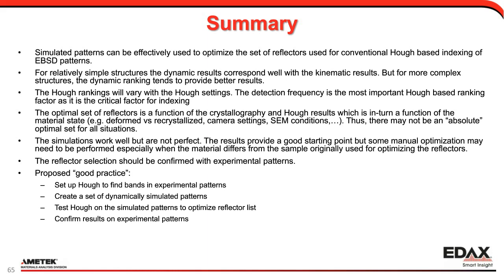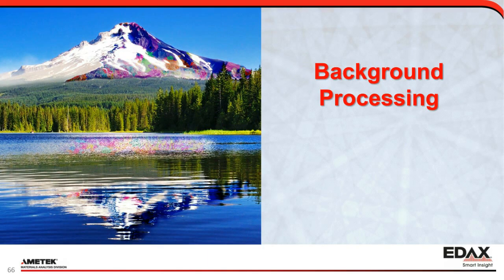And this will give us probably our best results that we can get to get started with indexing a new material. So that wraps up what I wanted to say about the optimization of the reflector list. I want to move on now to the background process.